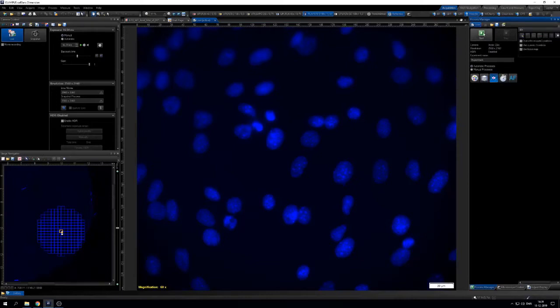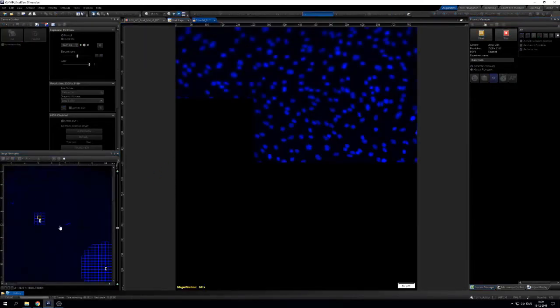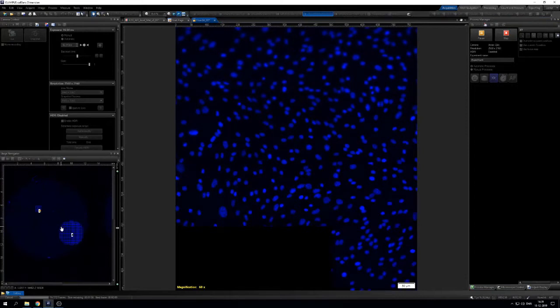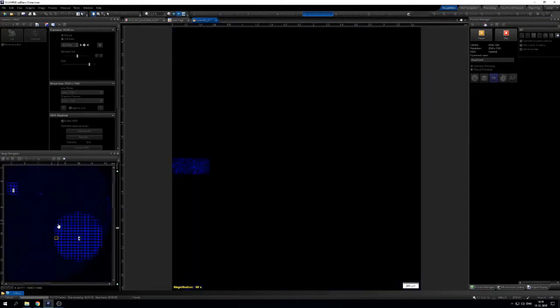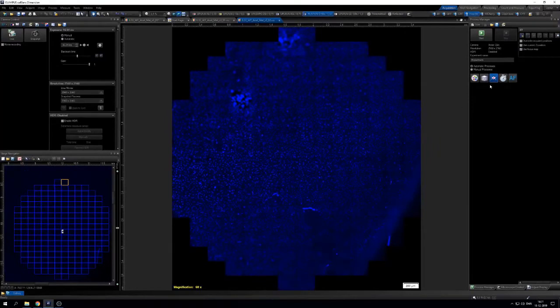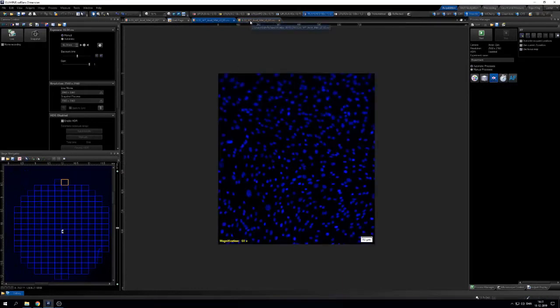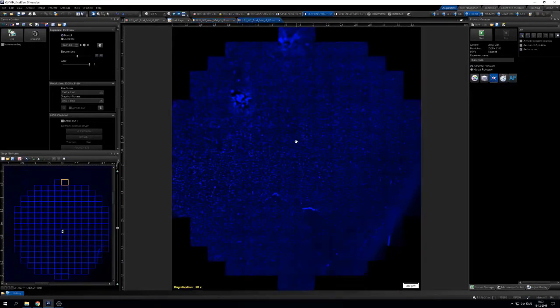Then I'm going to Process Manager, adding multi-positions. Once I add this multi-position and press acquire, it will go through my 2 positions. And it will take some seconds or some minutes, depending on the areas, the small position here and the big position with the numerous images.